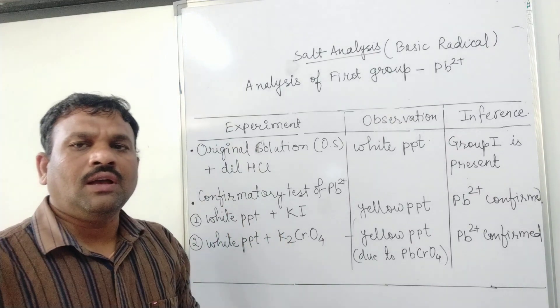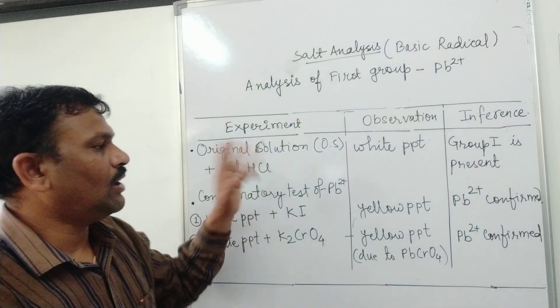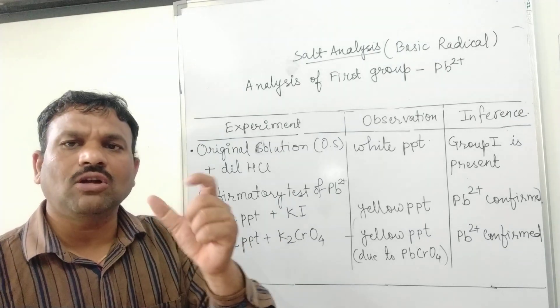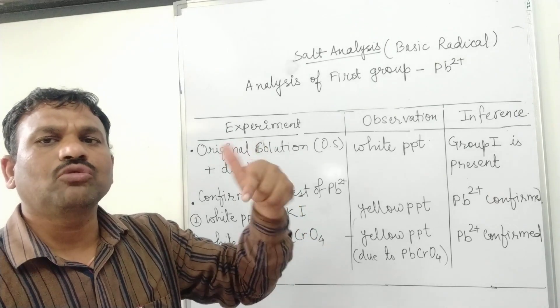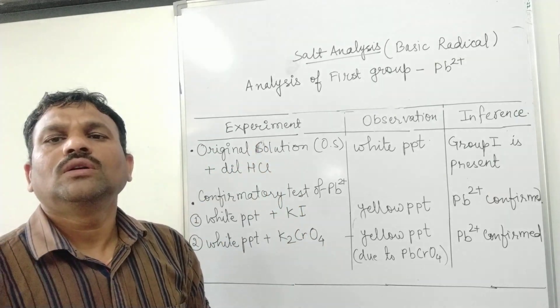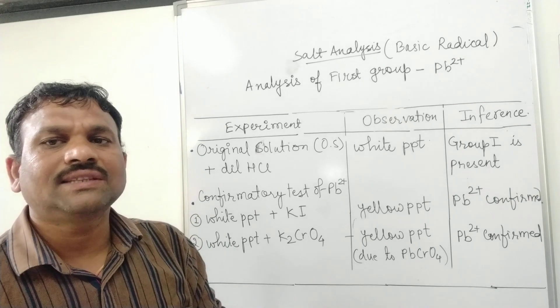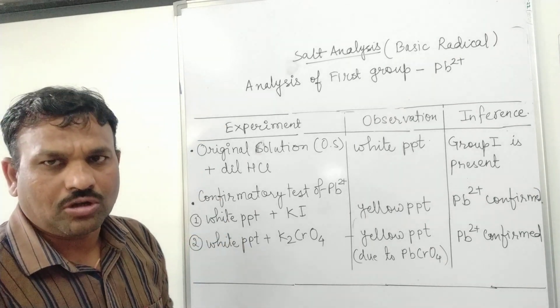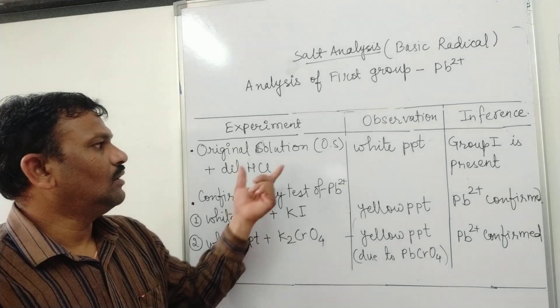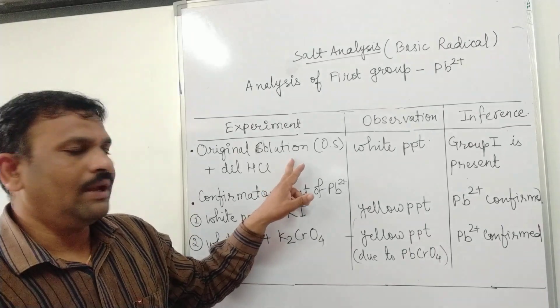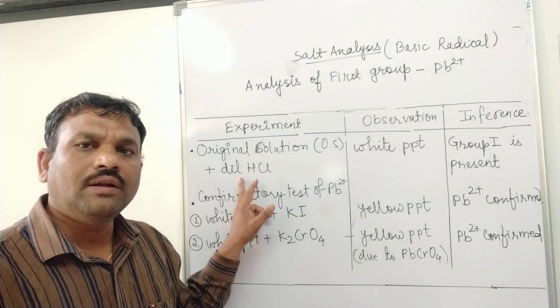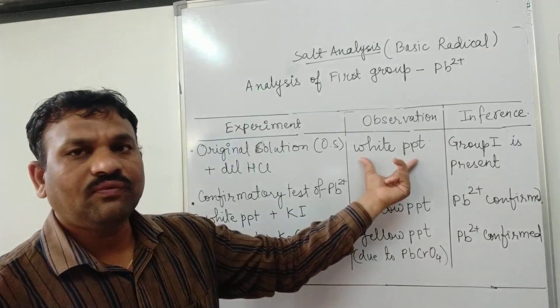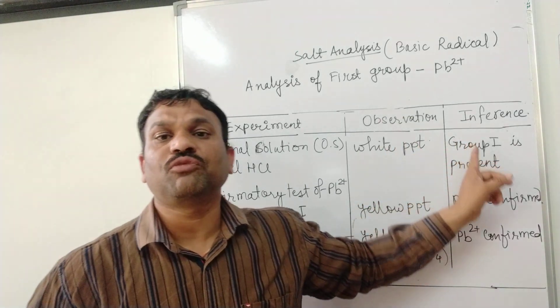First of all, for the testing of lead ion, we have to prepare the original solution. For the preparation of the original solution, we take the salt in a test tube and add some amount of water. Although the solubility of lead salt is not very high, so we have to take a very small quantity of the salt. When we add dilute hydrochloric acid to the original solution, it forms a white precipitate.